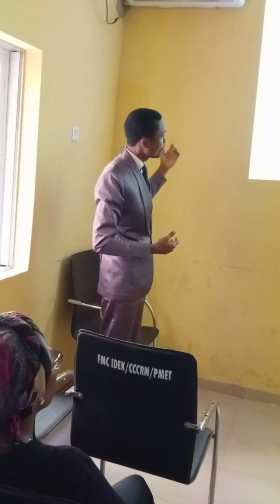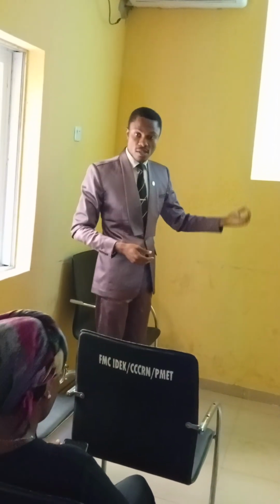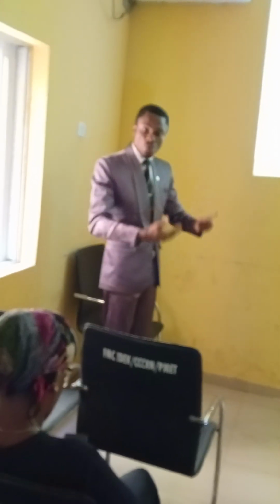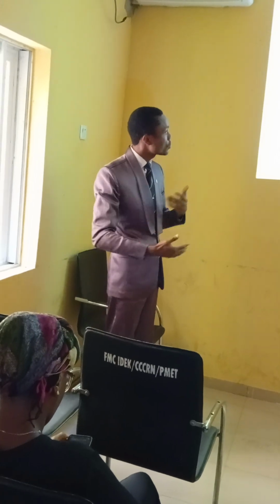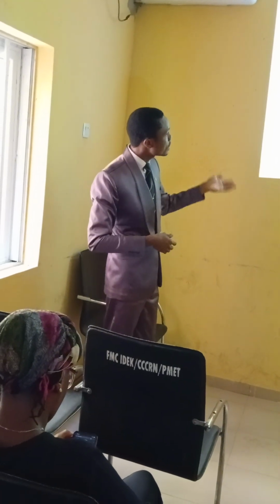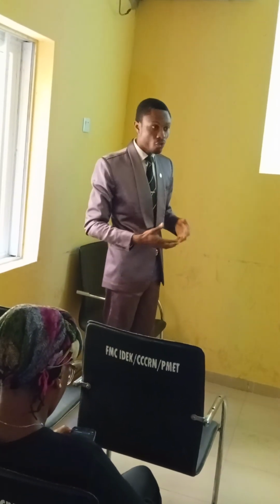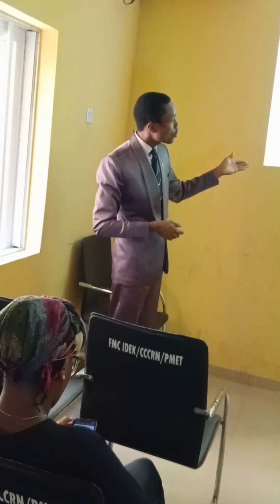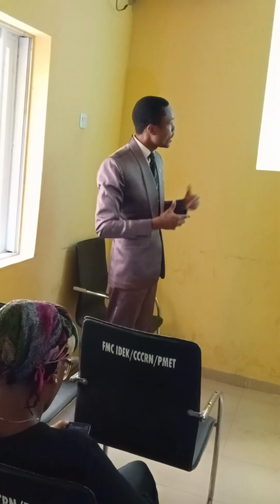Then there should be continuous professional training, especially when new scientists are coming into the laboratory, there should be training, and even for the ones on ground, the training never ends. It can always continue to refresh one's memory. Then quality control and auditing should be done regularly. There should be proper documentation and feedback. Then adoption of modern technology if possible, and collaboration between the pathologists and the scientists.